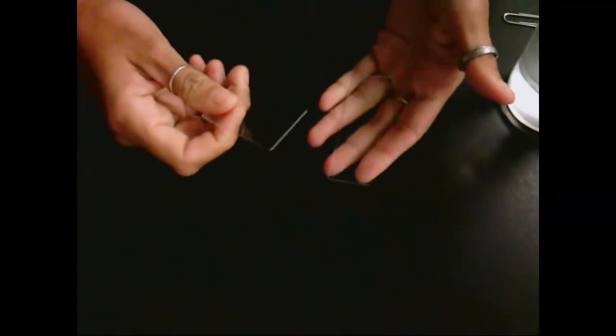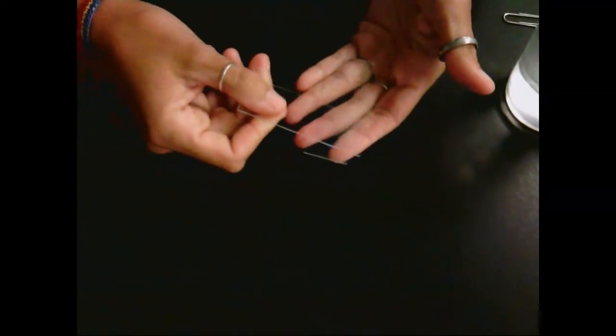Okay, so under the adhesion section, the first thing asks you to take two microscope slides. They look like this. And place them together. As you can see, the one that's sitting in this hand is just kind of hanging out there. I'm putting them together, I'm pulling them apart.